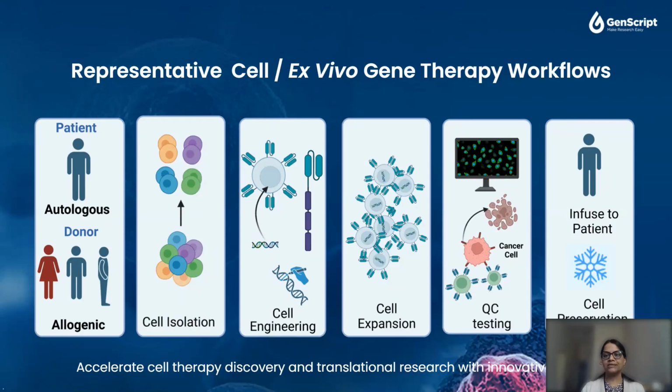And throughout all these steps, various quality control measures, safety assessments, and regulatory compliance checks are performed to ensure the safety and efficacy of the cell therapy. So the cell therapy manufacturing process is continuously refined to increase purity, potency, stability, reproducibility, and batch size, while developers are also trying to cut down on time and cost.